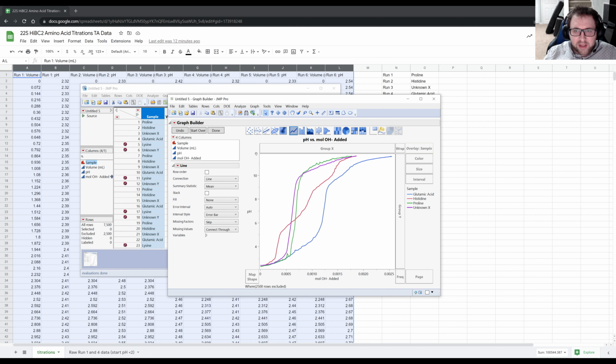Now this next set of graphs we asked for is, okay, we want this, but one for each graph with the little pKa's noted on there. So I'm going to show one of these. I am going to show quickly why we can't just wrap them, which would be super nice. But if I put a line on this, it applies it to all of them, which is why we're not going to do that. All right. So let's get rid of this.